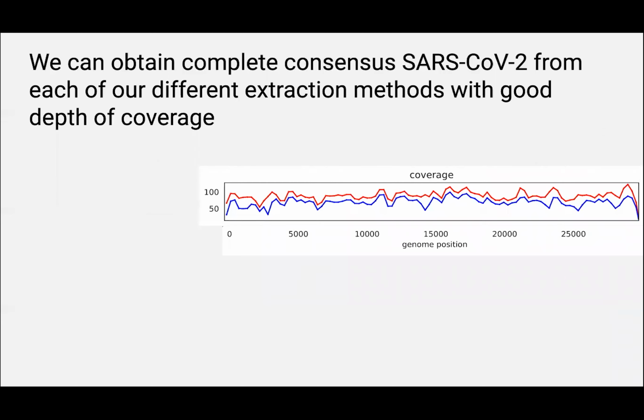When we look at then what the breadth of coverage looks like for these genomes, we can take one example, which was this one, and we can see the number of reads, so the coverage across the genome, and it's rather consistent, which is good. We're seeing the entire genome, and we're seeing several dozen to sometimes up to 100 reads at any given position.